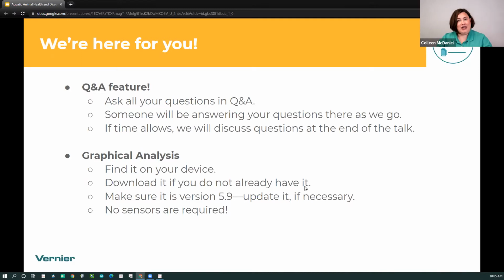So today we're going to be using one of our applications called Graphical Analysis. Ideally, we're going to be able to share some data over the internet with you when I've collected it. If you have your own device, it can be a cell phone, an iPad, or the computer or Chromebook you might be watching this on, I would recommend you go ahead and download it.